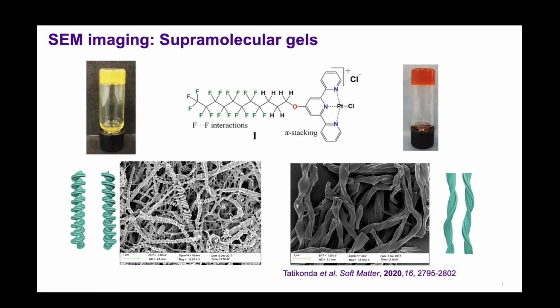This is not the only thing. You can also detect X-rays from this. You can do elemental mapping. There are more advanced techniques.